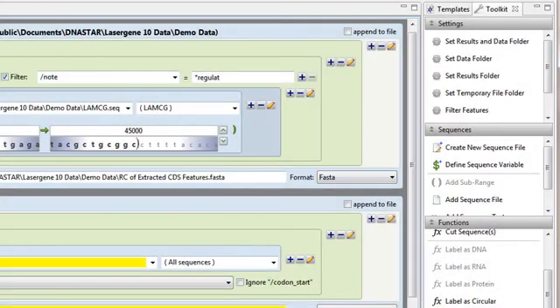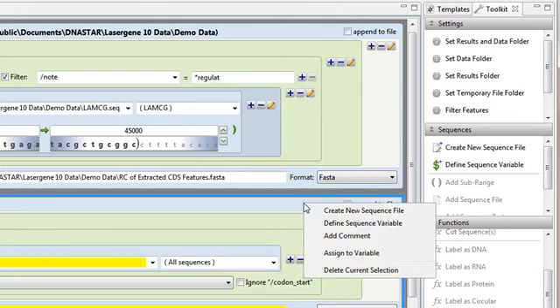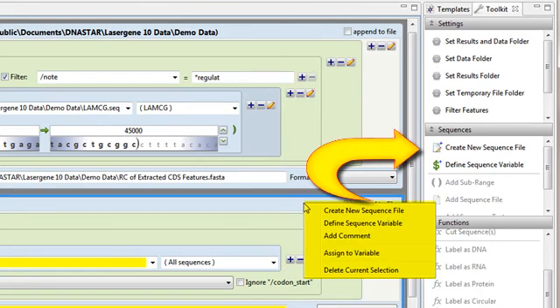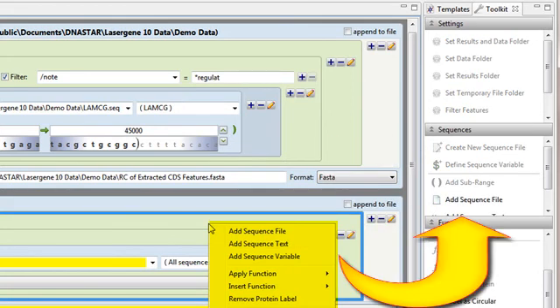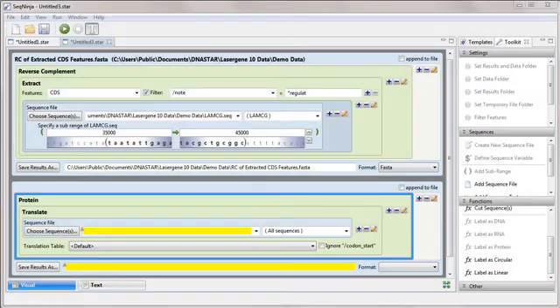SeqNinja also provides context-sensitive right-click shortcuts to items found on the right. For now, I'll return to the earlier version of our program.